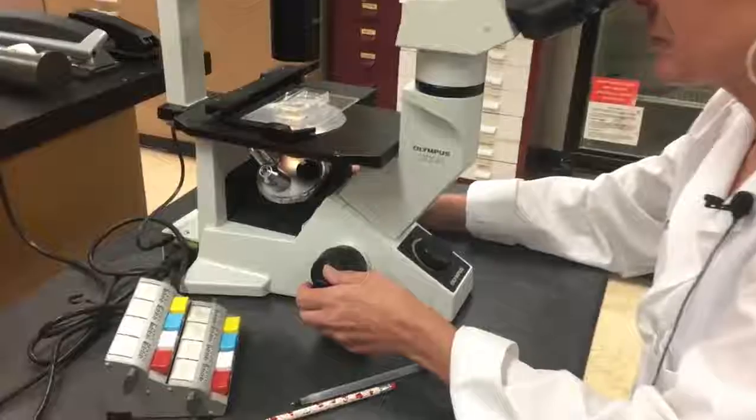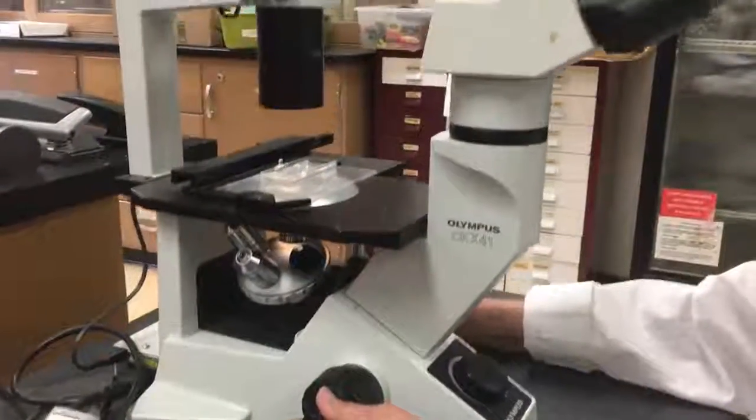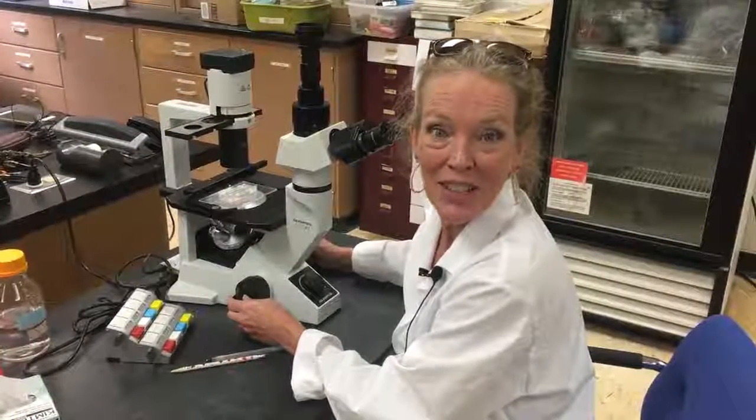So if I do see a nematode, I can see it from the bottom side into my oculars. Lucky for this guy, he doesn't have any plant parasitic nematodes — yay! You know, Hannah, the entire time I've worked here, I've yet to see what kind of cool stuff Sheila gets to do in the nematology lab, and that was really interesting. Catch us next week for our last and final part of the three-part nematode series, when Sheila describes what symptoms nematodes cause. See you then, bye!